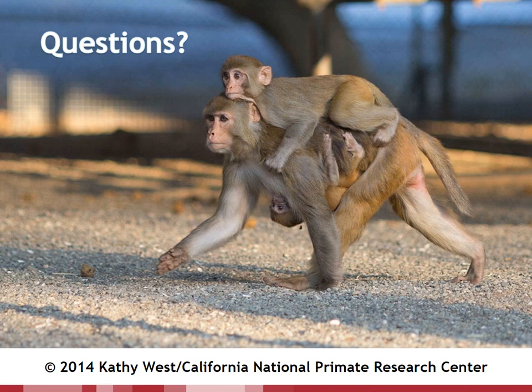Barack has asked, how do you see this biomarker approach improving drug development? Thank you, Barack Gunter. That's a great question. I have particularly tried working with all of these behavioral models here in the lab, and specifically for the one with the anxiety reducing effect, the conflict model, it's really hard to establish and maintain. The baseline will fall very quickly. So I believe with the EEG approach, specifically for anxiety reducing effects, it's a much quicker approach, once the model is established, to test whether a new drug would have an anxiety reducing effect based on the beta band increases. That's the effect that we'll be looking at.